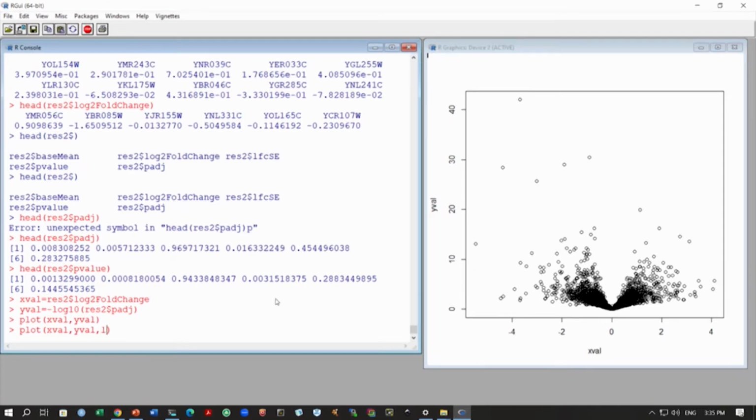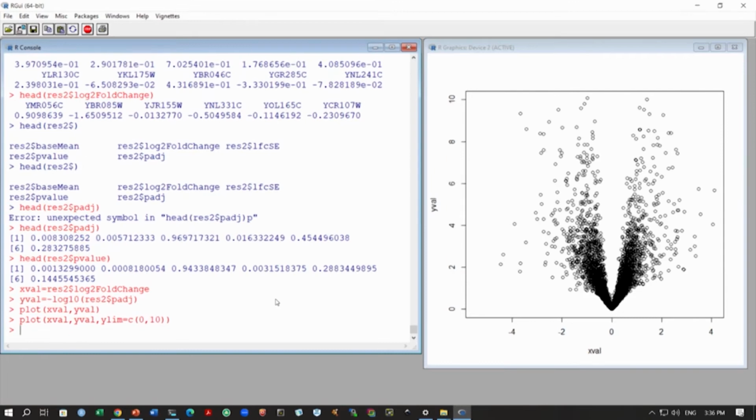Okay. So, let us try that. What we will do is we will change the limits of the y axis from 0 to, let us say, 10. Above 10 we have very few points. So, maybe these are not really critical for these visualizations. And we can see this. The other option would be to make it logarithmic. That will change the shape of this curve.